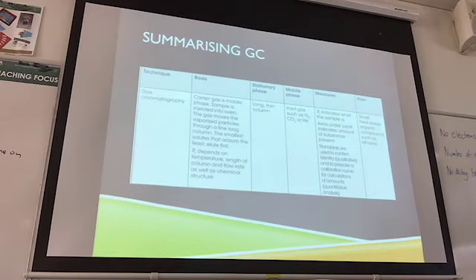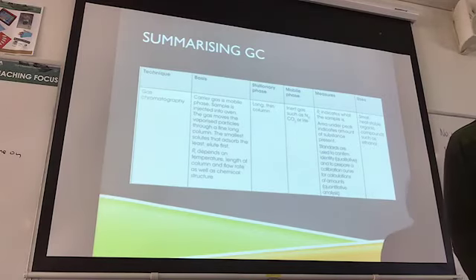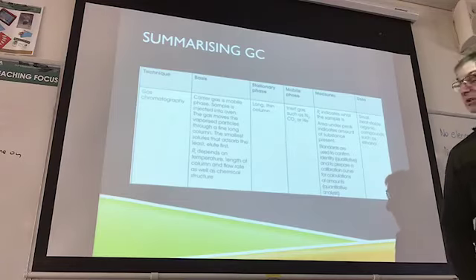So obviously you're going to need to maintain temperature, length of column, and flow rate if you want to determine different chemical structures. So the stationary phase is a long, thin column. The mobile phase is some kind of inert gas, could be nitrogen, carbon dioxide, or helium. We measure the RT, which is the retention time. It indicates what the sample is. If we look at the area under the peak, then we can work out the amount of substance present. And if we want to know the actual value, then we'll just use a set of standards and create a calibration curve.